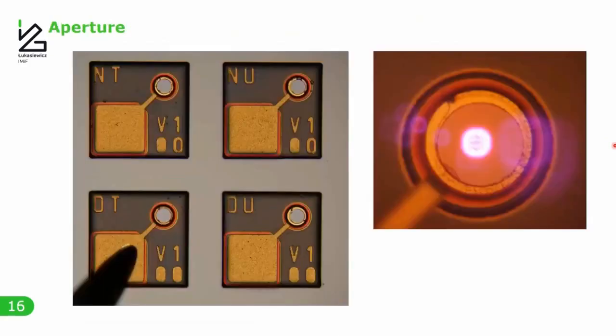Okay, staying with these VCSEL structures, we also saw that after the processing, some of these structures were operating quite nicely, others were completely dead, and others were just showing a very weak luminescence. So here we can also apply the failure analysis with the three-dimensional imaging. I'll be showing it as a cross-sectional view.